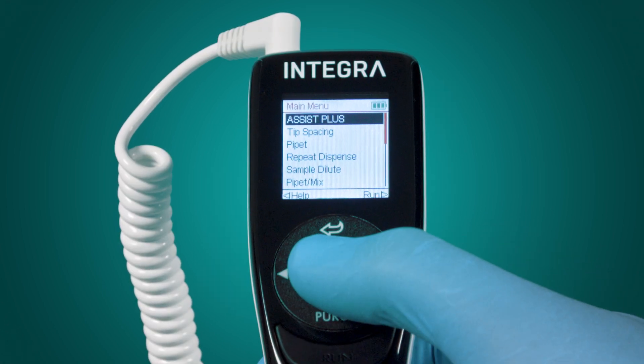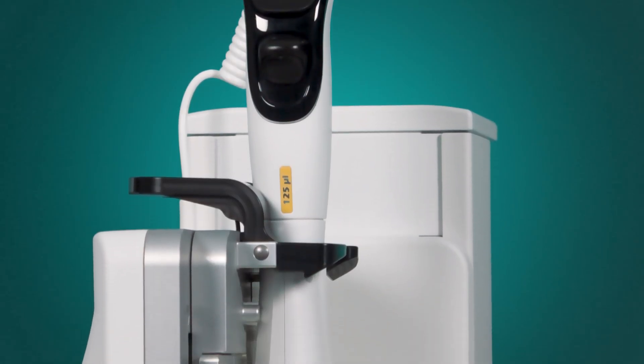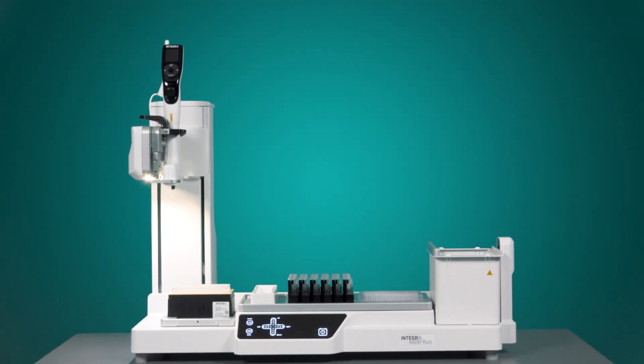To start the program, go to the main menu and select Assist Plus to establish a connection between the pipette and Assist Plus. If a pipette is connected for the first time, it needs to be paired first.